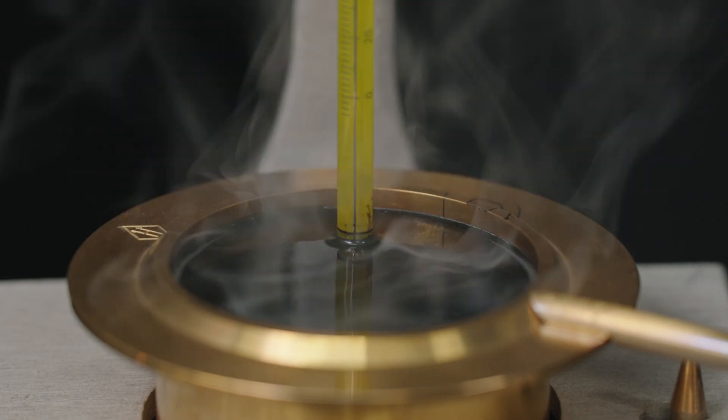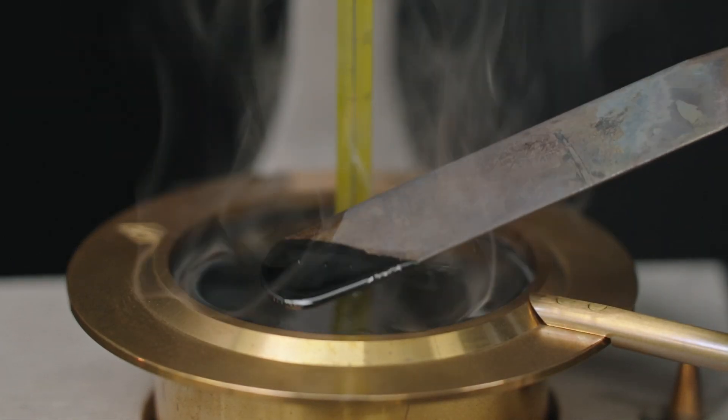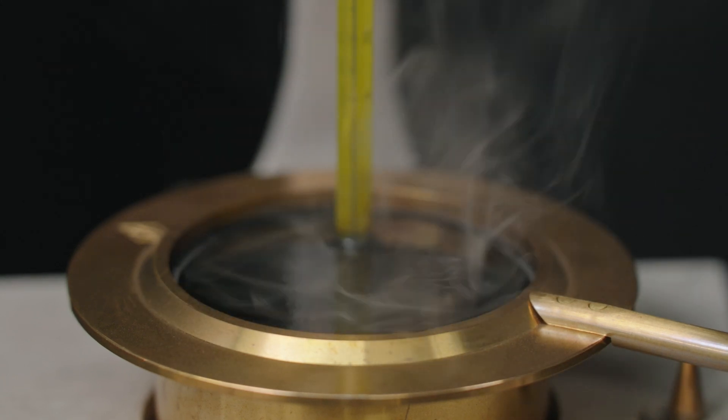If a film forms on the surface of the sample, gently move it aside with a spatula, paper clip, or other suitable implement prior to the next pass of the test flame.